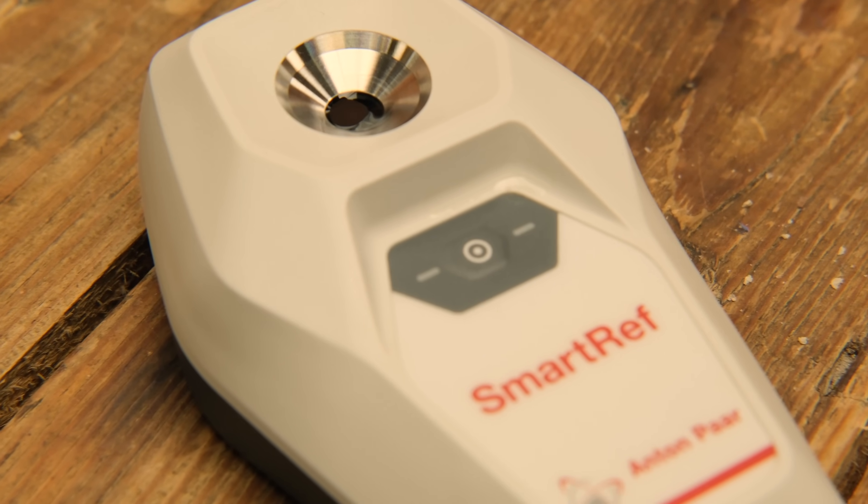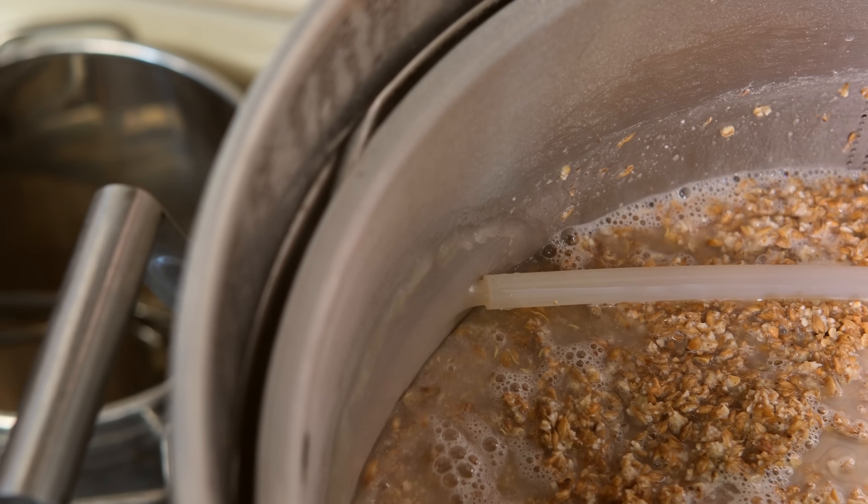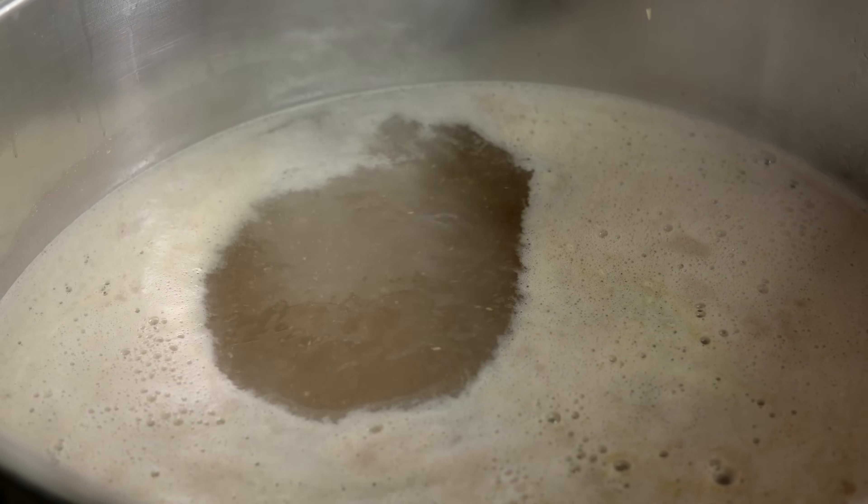Should we move on to SmartRef? At the moment you've only had the chance to use EasyDens on its own, but now we've got SmartRef as well, and this combined with it gives you a whole new range of things you can look at. This is really cool because as a standalone bit of kit, it works the same as a refractometer, and it works with Anton Parr's Brewmeister app, the same as the EasyDens does. This works on pre-fermentation work. There are ways to calculate gravity based on a refractometer reading during fermentation, but it involves using calculators and could be less accurate. The SmartRef is a really handy tool for brew day — tracking your conversion through the mash, checking your pre-boil gravity, checking gravity throughout the boil to see whether you need to look at more boil-off. So you can make those on-the-fly adjustments that a refractometer gives you over a hydrometer.